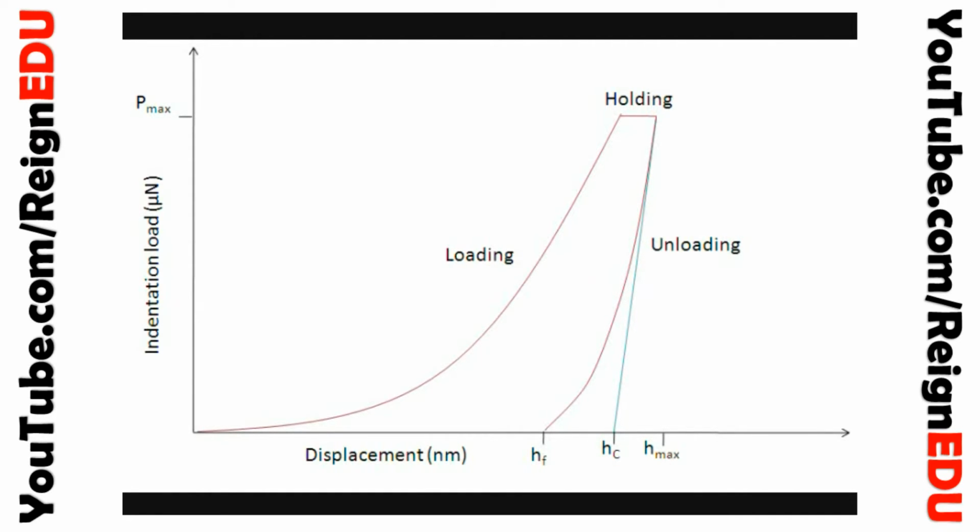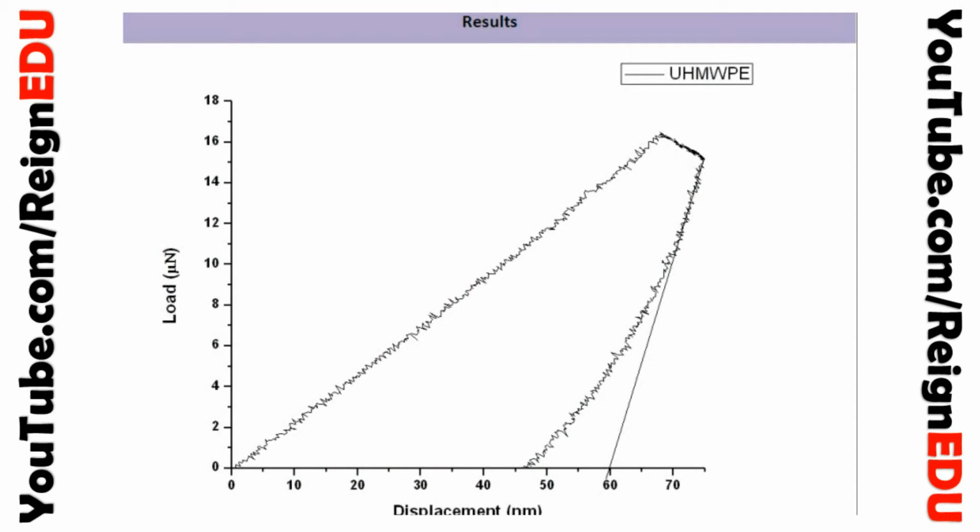Results of the experiment are as follows. Ultra-high molecular weight polyethylene based composites are used. Ultra-high molecular weight polyethylene has been chosen as the reference material. This is the load versus displacement curve obtained for ultra-high molecular weight polyethylene. The maximum attained load is 16 micronewton and the maximum displacement attained is 75 nanometer.